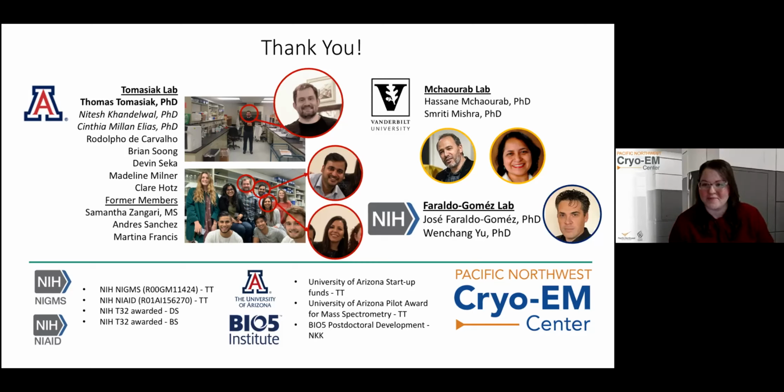The only caveat of the GP2 is that the dewar for freezing is fixed. So if it gets icy, you just have to wait it out until it goes back. But the temperature controlled cryogen holder is excellent. The liquid nitrogen monitor is excellent. So we find that it's really high throughput. I think we've frozen like 40 grids in a day, within a couple hours, using the GP2.